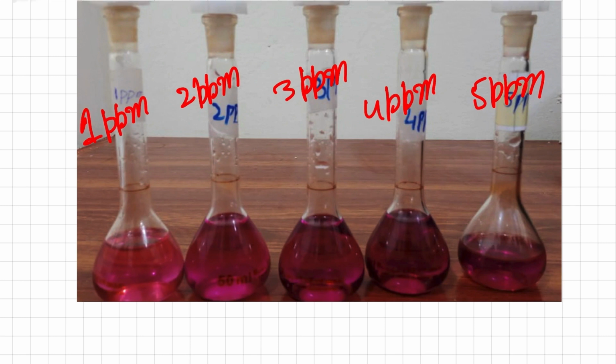So we will first convert the solutions into colored solutions, and then we will use the visible range of the spectrophotometer in order to determine the unknown concentration. This step is also called the derivatization step, and it is defined as the steps to tune the sample in order to run it in the best possible method that is available in our instrument.